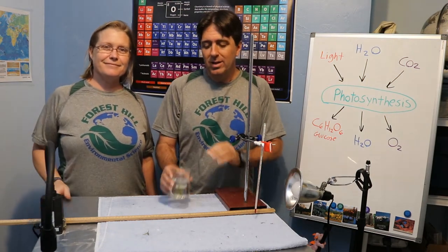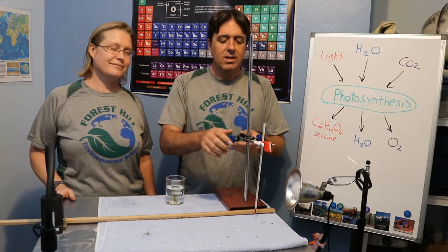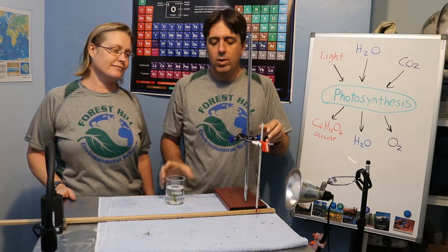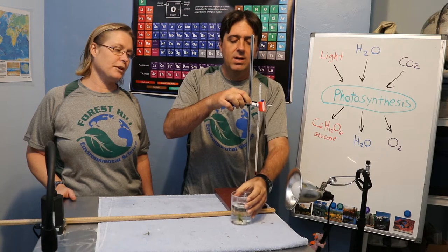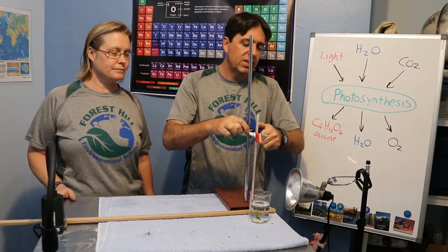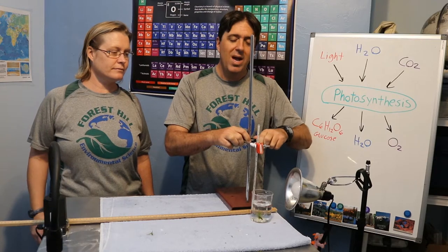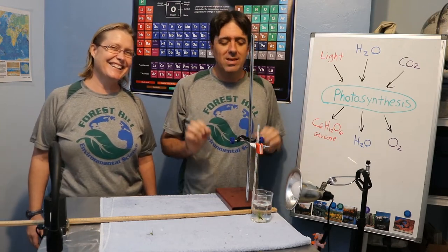Now that we have the Elodea loaded in the beaker, let's talk about the rest of the experimental setup. I set up a ring stand with a thermometer to monitor the temperature of the water bath the Elodea is sitting in — we want to make sure it stays constant the whole time. When designing experiments, if you don't monitor and measure your constants, how do you really know they're constant? You don't. So you have to know that temperature is not influencing the actual experiment.